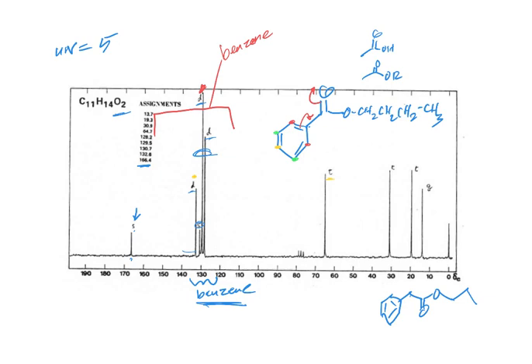Yeah, good question. I'm not sure that we can, without some simulation or with like a proton spectrum, right? That would easily tell the difference between those two. That we can tell for sure between those possibilities. Yeah, good point. Or even CH2CH2 in between there or something like that, right? We do know that we have to have a CH2 that is attached to the oxygen.